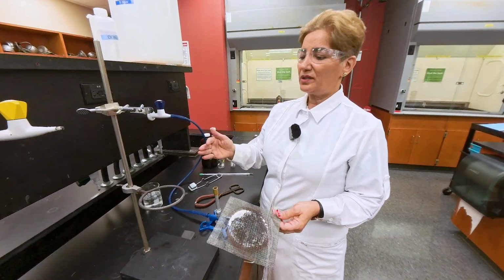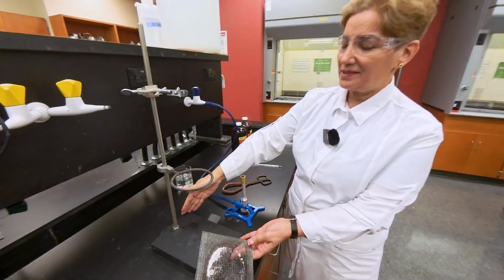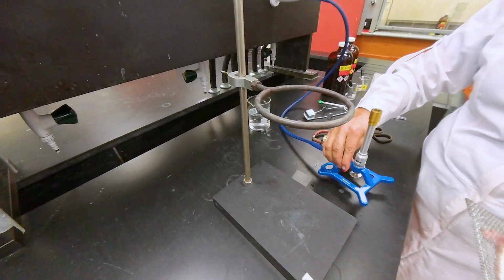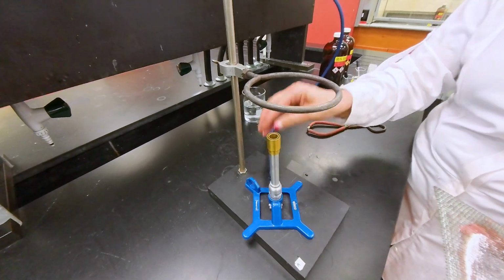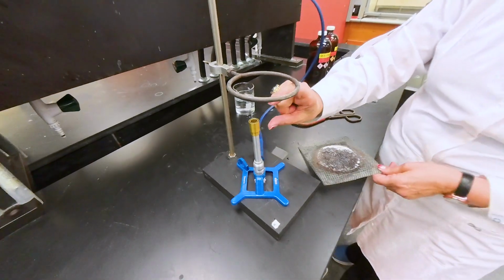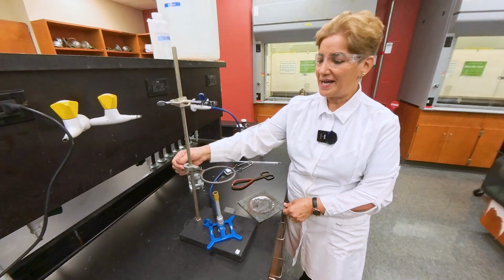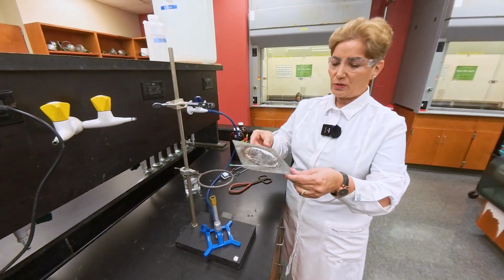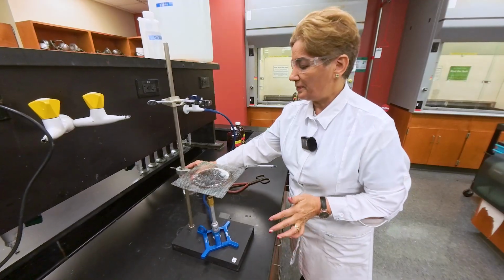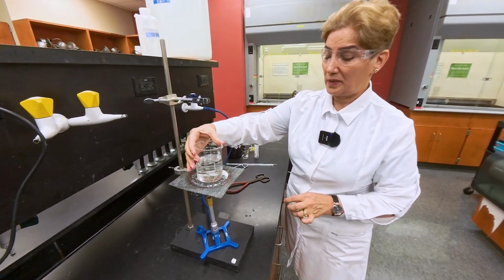So to set up the hot water bath, I'm using an iron ring stand. I attach the iron ring. The level of the iron ring is important because I don't want it too far up or too low, since I need to place my Bunsen burner about 2 inches below the ring. So I attach the iron ring, use a wire gauze, and fill up a beaker about halfway with water. I place it on the wire gauze.